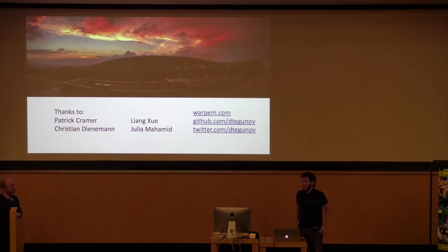Thank you very much for an impressive talk. Any questions? Bruno? It's indeed very impressive. I was wondering how the tilt data were collected. Which design scheme, or which way?